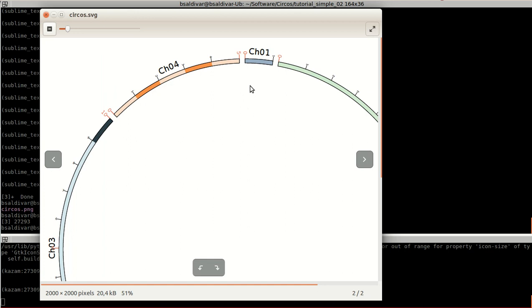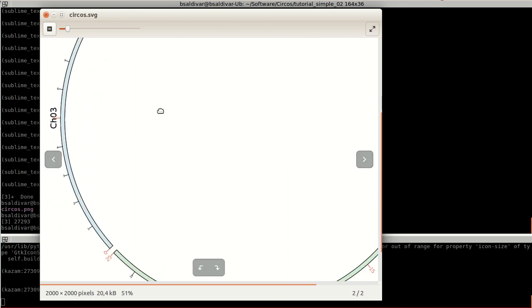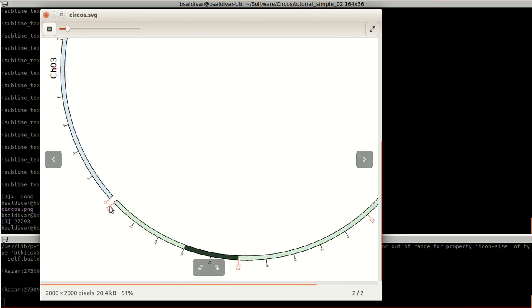So here I will show you how to create these bands and also how to create these ticks that appear from 0, 1, 2, 3, 4, 5, and each five units have a bigger tick to indicate the separation.